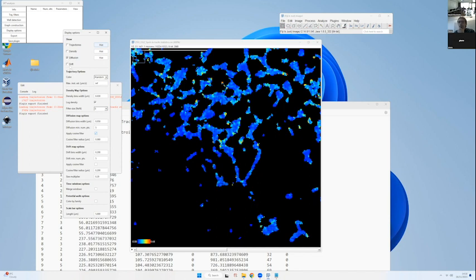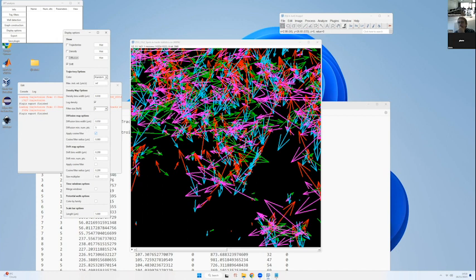All right. Should I move to the drift? Okay. So the drift, basically, it's mostly the same thing. Just there is one option that's interesting. It's the one at the bottom, the size multiplier. Here, you see these arrows are massive.